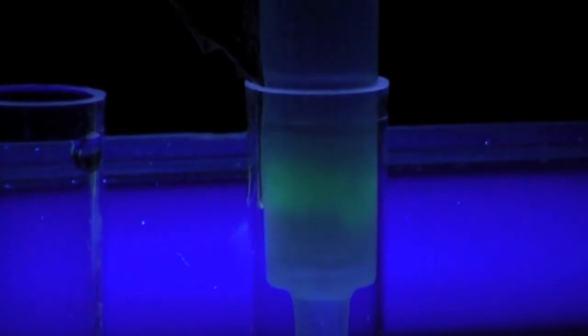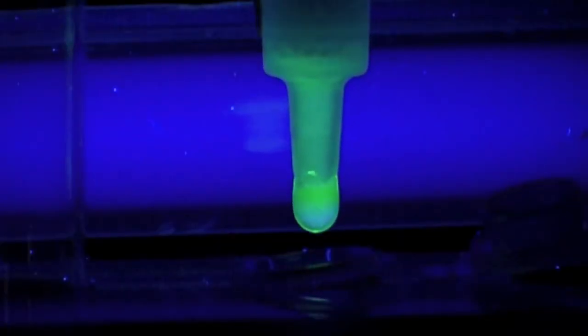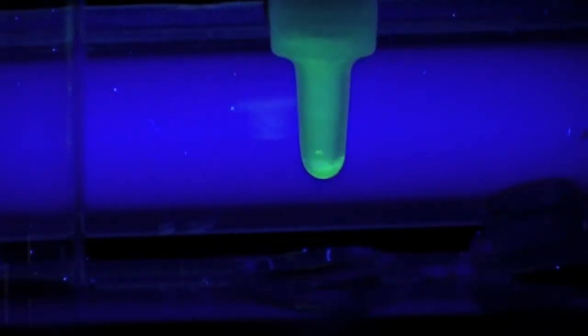Observe as the band of GFP moves down the column. As the first drops of GFP appear at the tip of the column, you may wish to collect the sample in a microtube for more convenient storage.